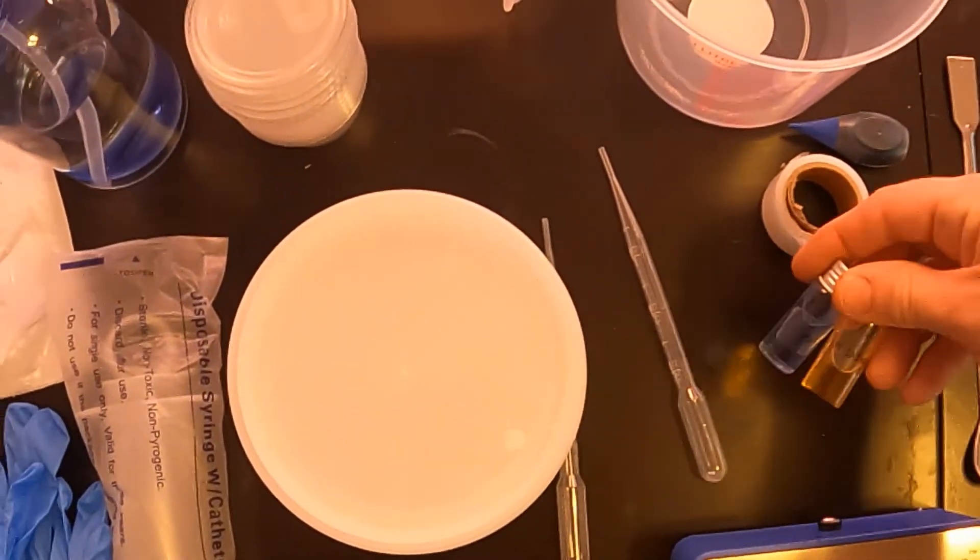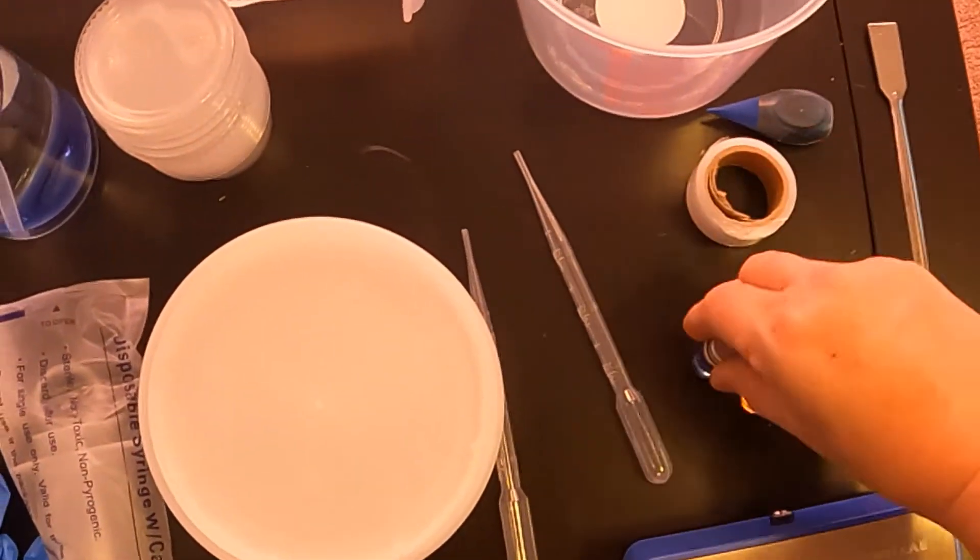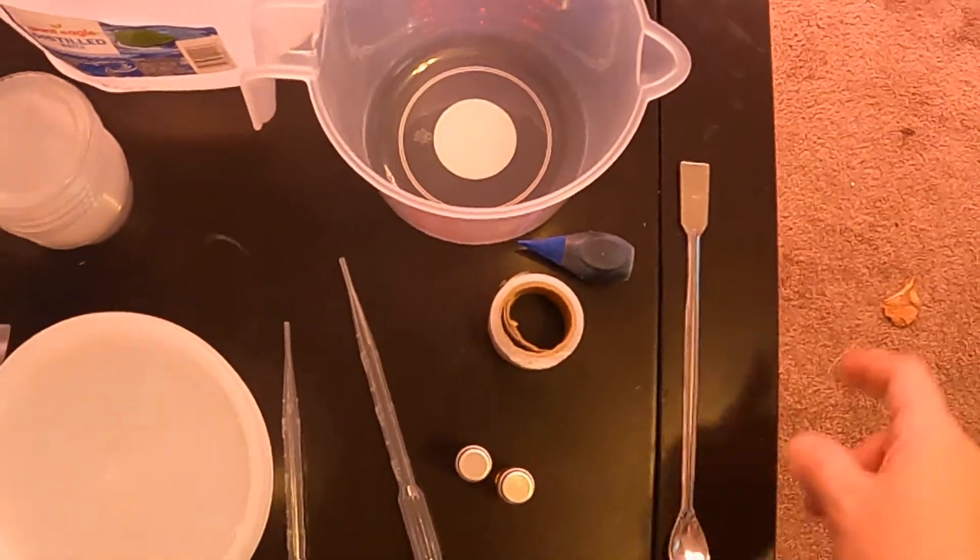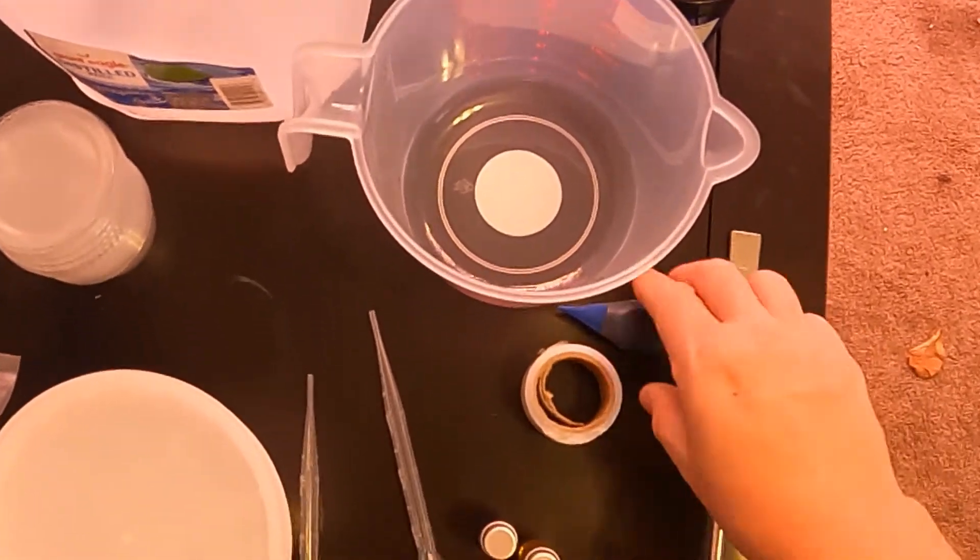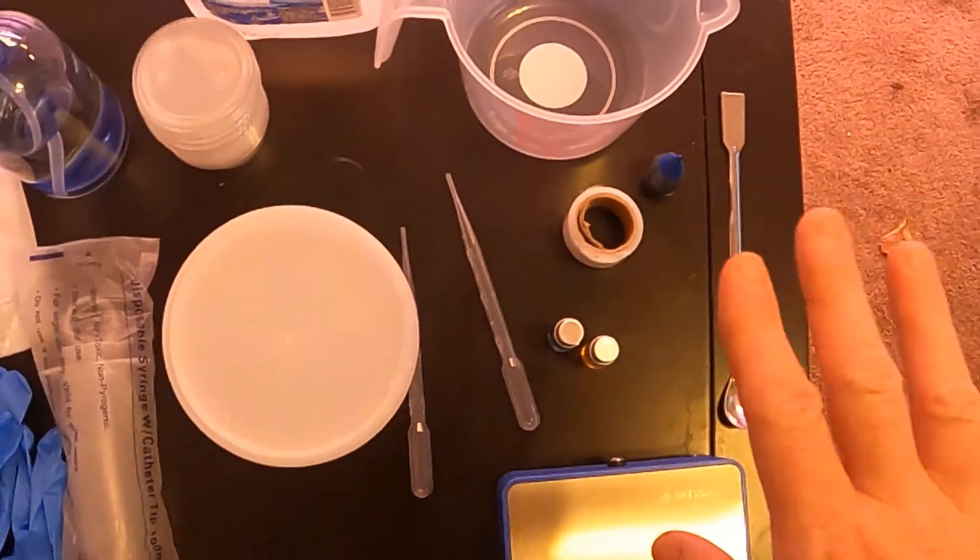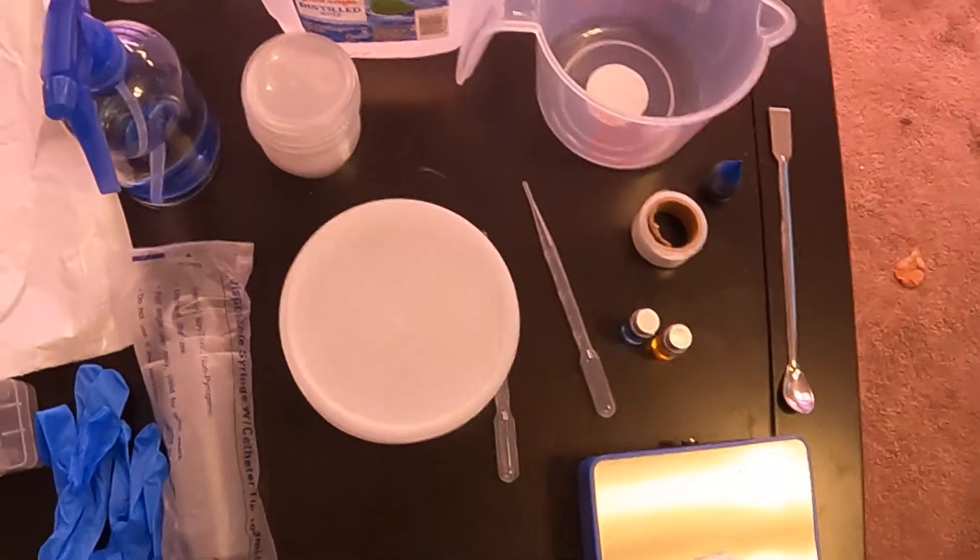I have some pH up and pH down as well as droppers to dispense those. A little spatula to help me out with the powder and then I use food coloring. It's a hundred percent unnecessary but it helps me differentiate when I'm making multiple types of media.